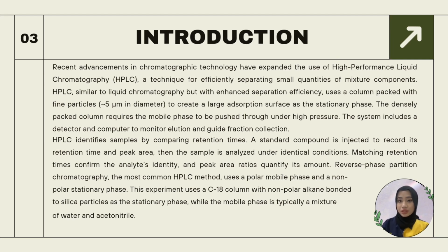HPLC identifies samples by comparing retention times. A standard compound is injected to record its retention time and peak area. Then, the sample is analyzed under identical conditions. Matching retention time confirms the analyte identity, and the peak area ratio quantifies its amount.